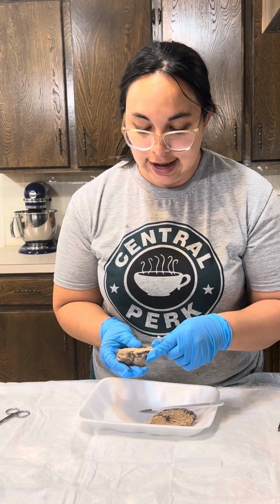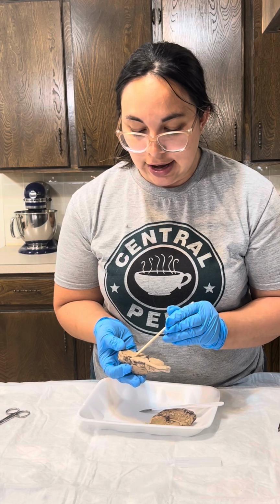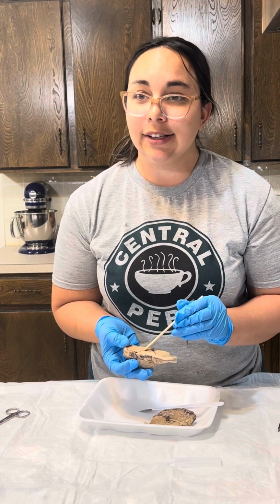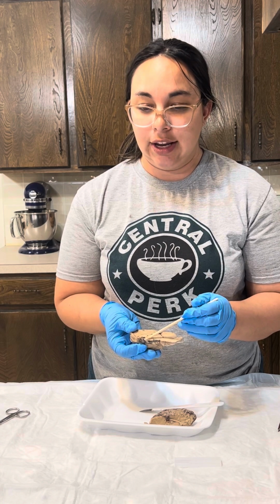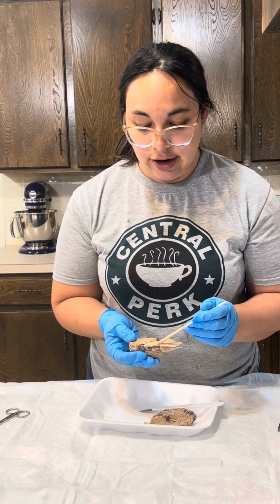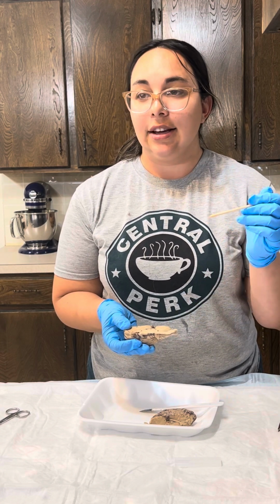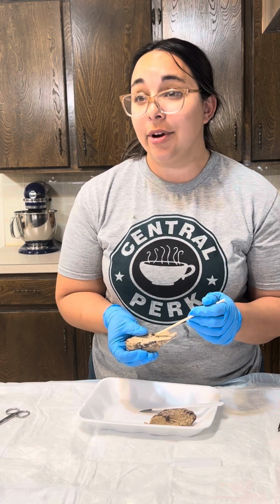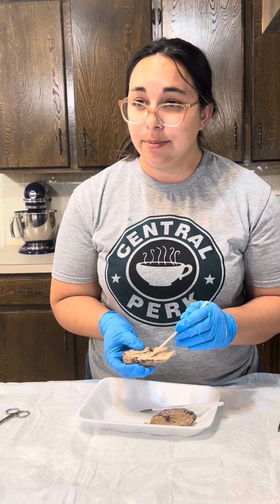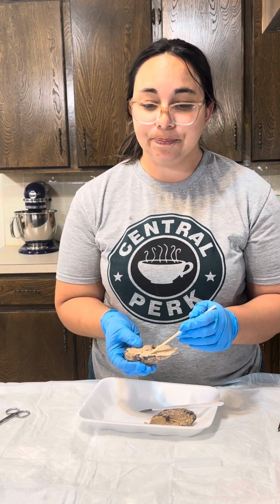And then inside this, there's a part you couldn't see before. This right here is your thalamus, and it's responsible for relaying information. And then down here is your hypothalamus. Your hypothalamus is responsible for things like circadian rhythm and knowing your body temperature. That's what the hypothalamus is.